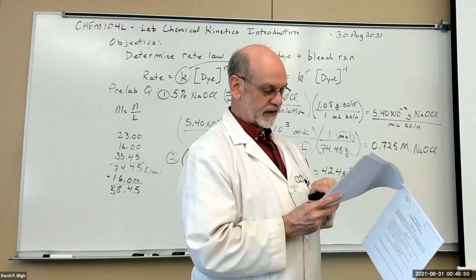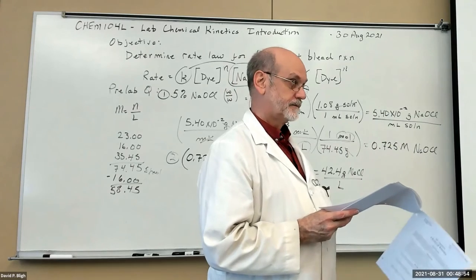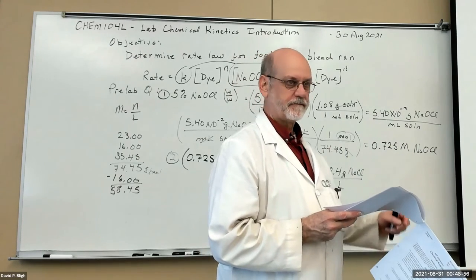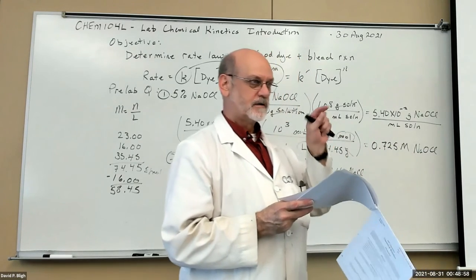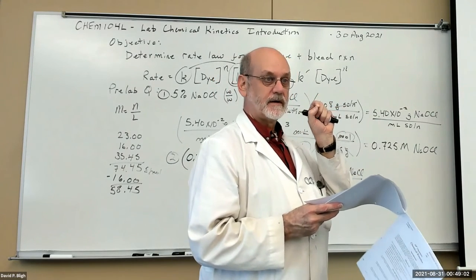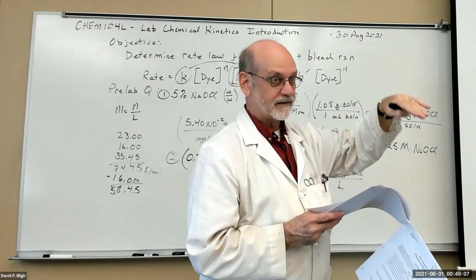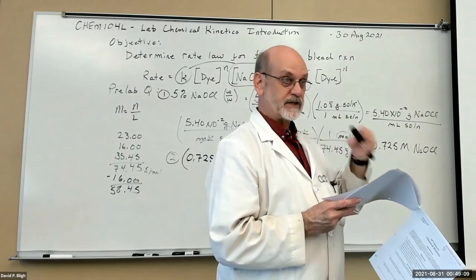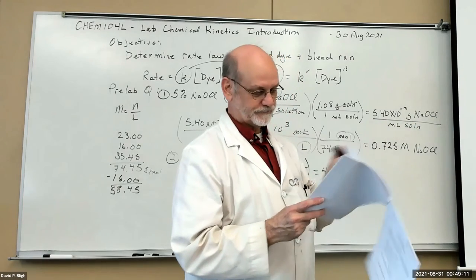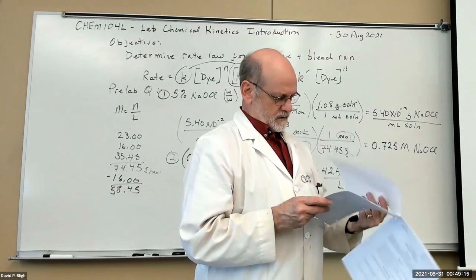And then there's the wavelength that we're going to be using. With a spectrophotometer, we measure the absorbance at that wavelength, and you're going to see the absorbance go down like that as the bleach does its dirty work. Okay.